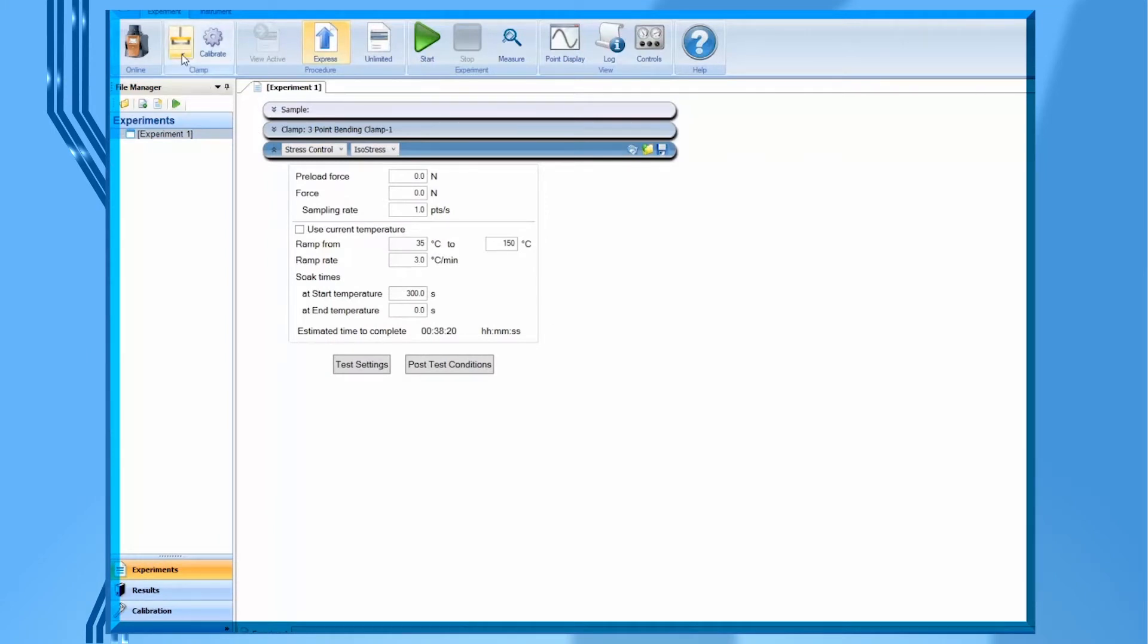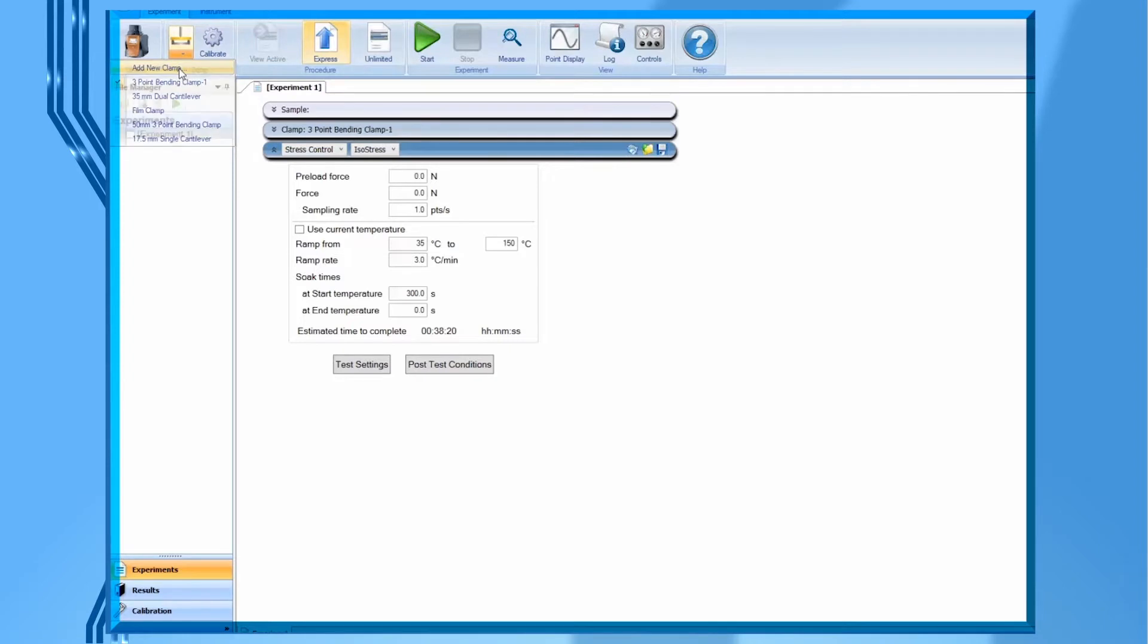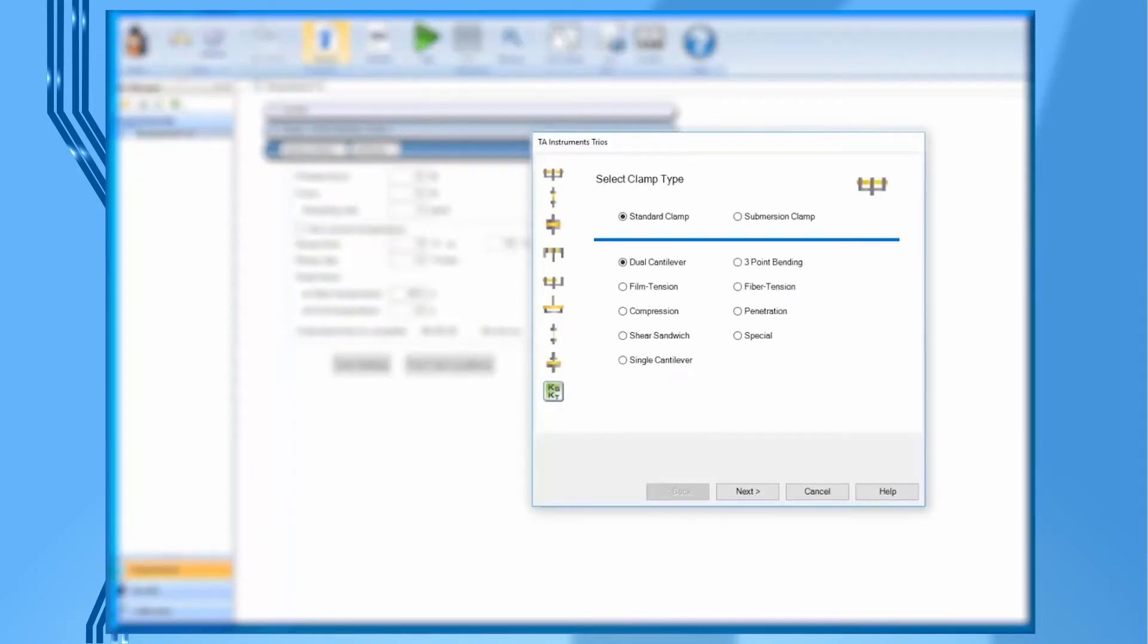If this clamp file has not been previously created, then you should click on add new clamp. Select dual cantilever, then click on next.